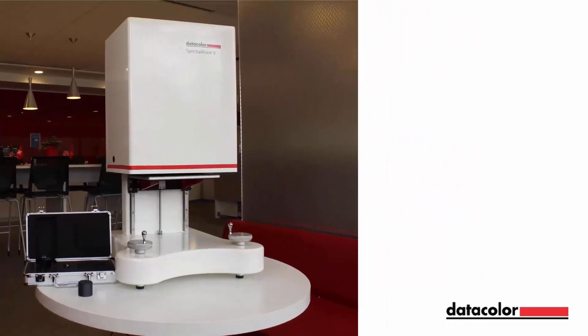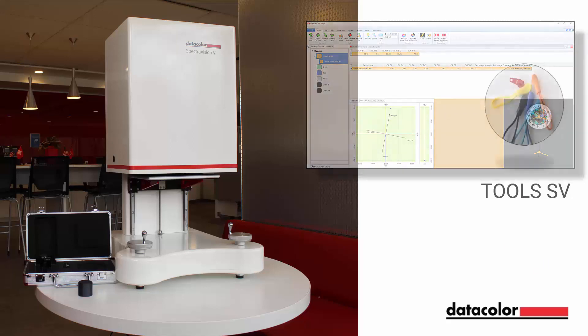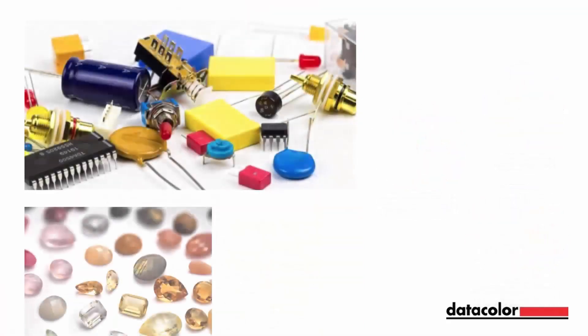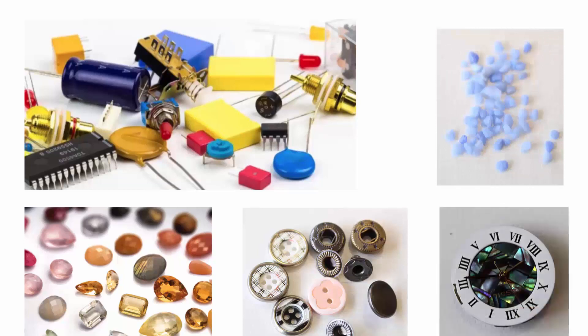This video illustrates the benefits of the new vertical spectrovision together with the companion Tools SV software in an evaluation of sample materials that are difficult to measure in a regular spectrophotometer or in the horizontal configuration of spectrovision. We will show how samples with irregular shapes, very small sizes, or aggregated pieces of similar colors can be measured using the new vertical instrument.